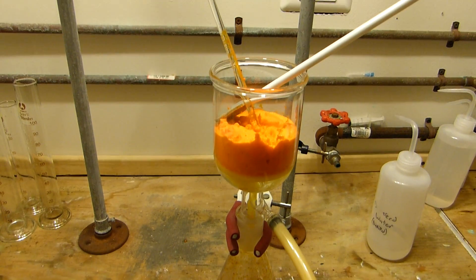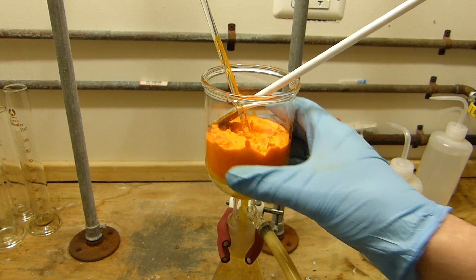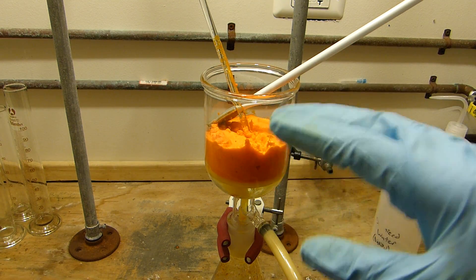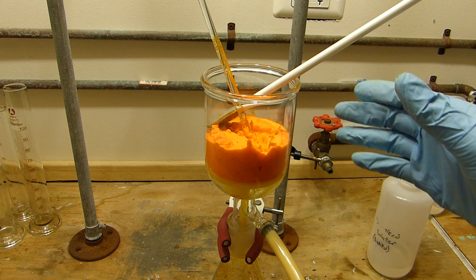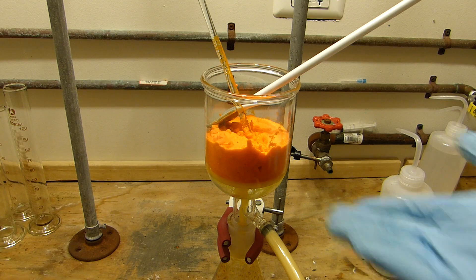All right I'm going to leave this on the vacuum for about 10 minutes just to get as much water as I can out of it. Normally you'd wash a filtrate with cold deionized water or something like that. But you'll notice that in this preparation most of the contaminants in the solution anyway are volatile. You have hydrochloric acid, water, and pyridine.